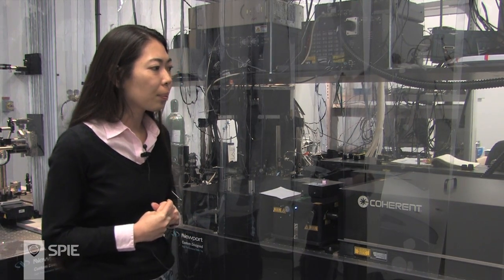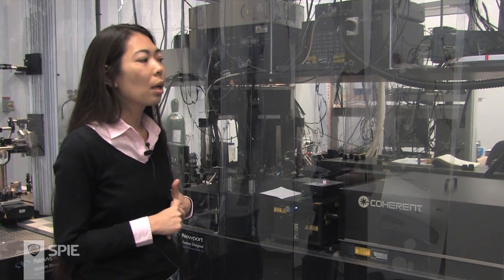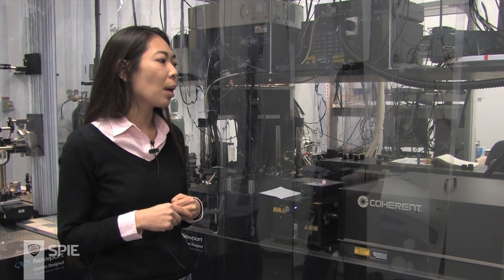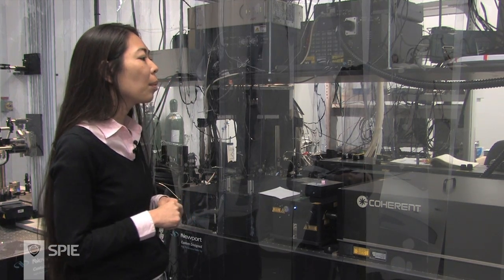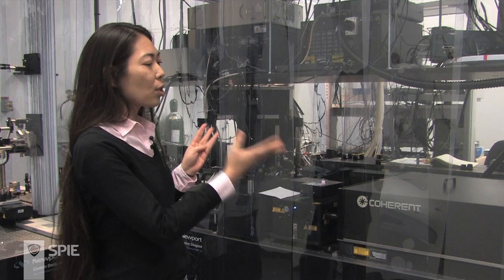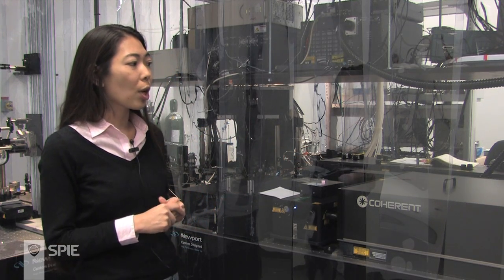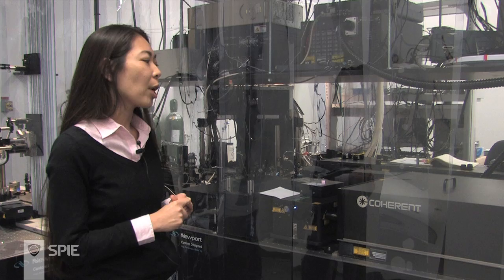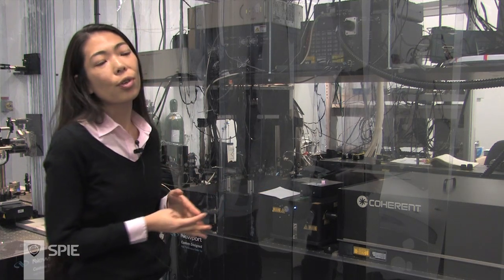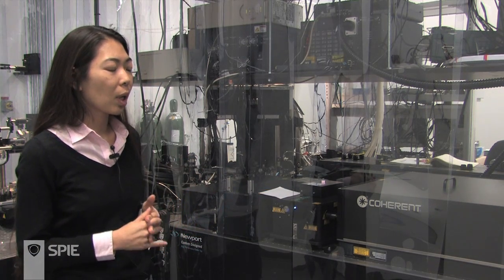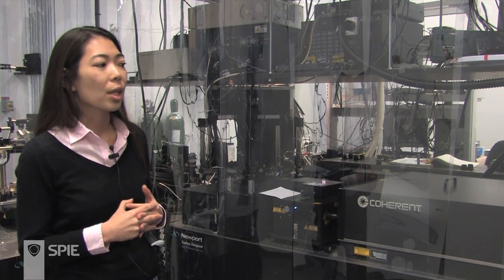we use anesthetized rodents. These are often transgenic animals that mimic Alzheimer's disease or have fluorescent proteins in the brain so we can see what's happening. These two setups are used for imaging neurons and blood vessels in the living brain, and the second laser ablates vasculature to make small clots or hemorrhages to study stroke.